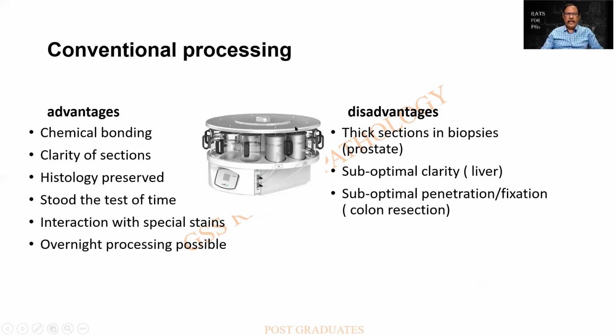The advantages are the chemical bonding is there, clarity of the sections, the histology is very well preserved, it has stood the test of time, it interacts with the various special stains as well as H&E, and overnight processing is possible. So even now the processing is going on in my college.